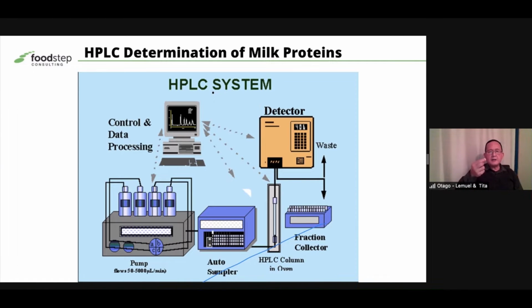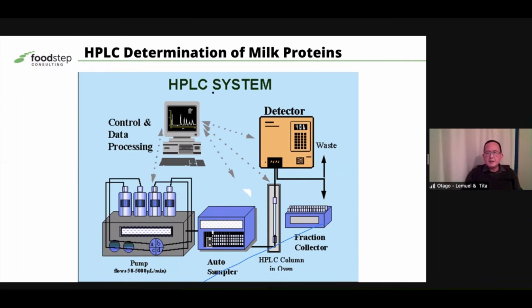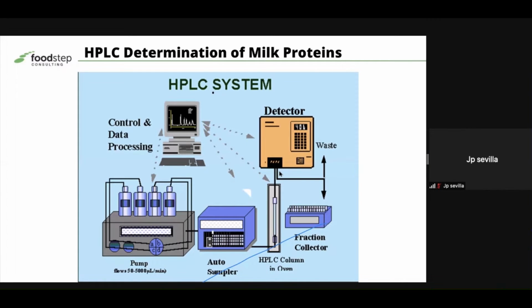separated the casein from skim milk by precipitation. Remember I mentioned acidifying it, and the casein will precipitate out. So what is left is whey. And in whey, that's where alpha-lactalbumin to as big as the immunoglobulins will be. So you want to see how much beta-lactoglobulin is present or how much immunoglobulin is present. So you get a sample of that and inject it into an HPLC system. I will not deal so much with it, but there's a way of detecting these different sizes. It will pass through a detector, and then it will produce a chromatogram.